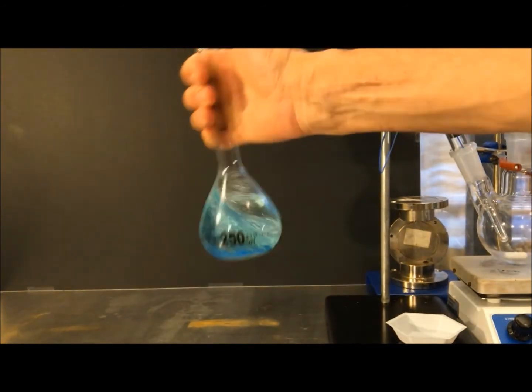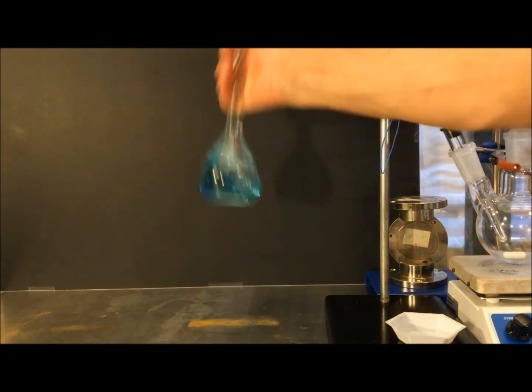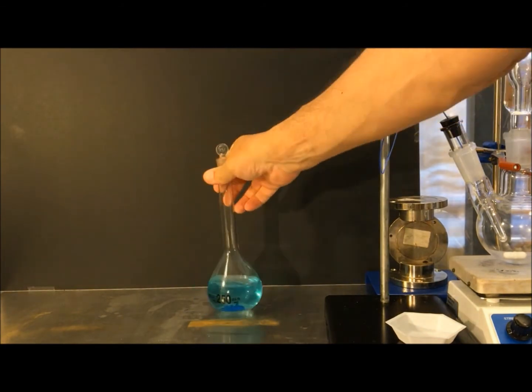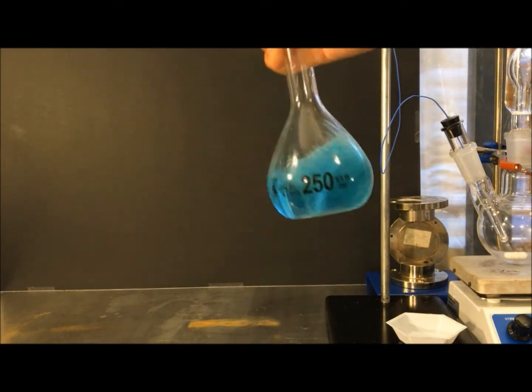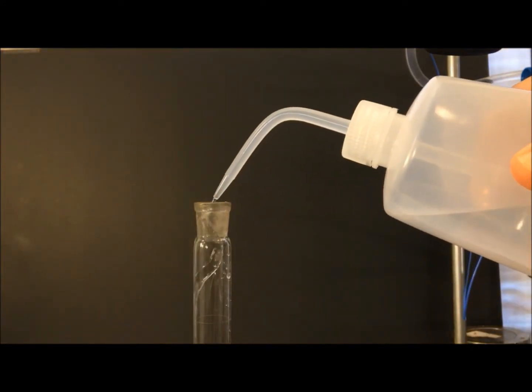These copper sulfate pentahydrate crystals take forever and a day to dissolve, so I would recommend grinding them up into like a finer powder before you try this at home. And once it is finally all dissolved, fill to the mark.